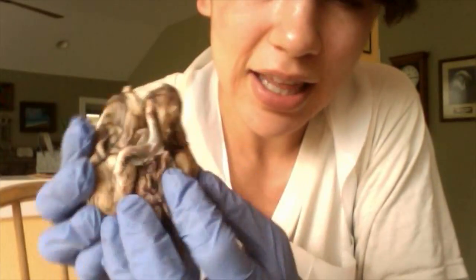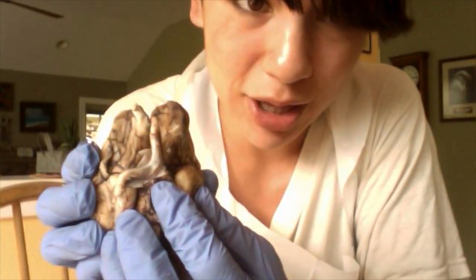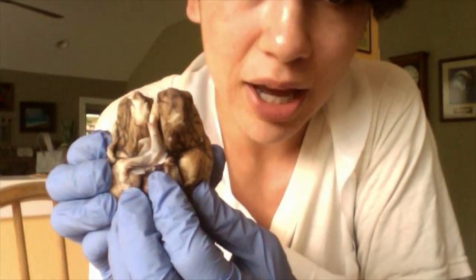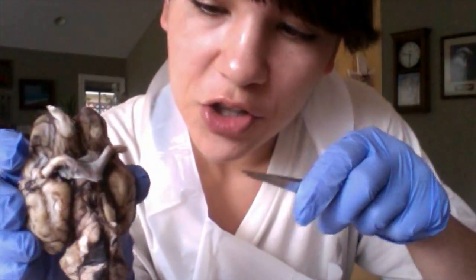But unfortunately, in this particular object, the pituitary gland has been severed. I think I might have accidentally removed it with the mac and cheese. But right here it would attach to the hypothalamus via the infundibulum. And there you go.